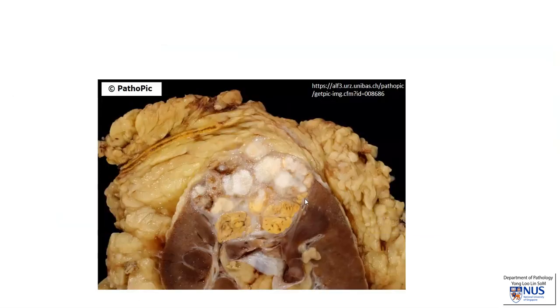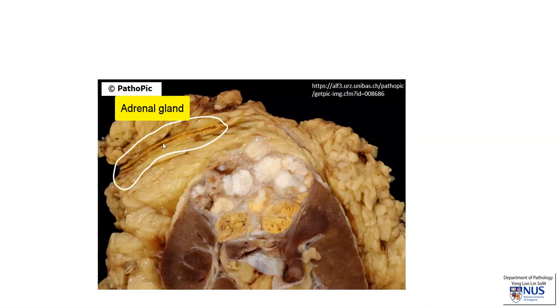Here is another example. The color is quite different here because this case has been fixed in formalin for a number of hours, so the kidney is a lot browner. This is the renal cortex, the renal medulla, and here we have the tumor. This is all perinephric fat, and in fact this is the adrenal gland — you can see the bright yellow adrenal cortex and the dark brown adrenal medulla. Clearly, the tumor is not involving the adrenal gland in this plane of sectioning.